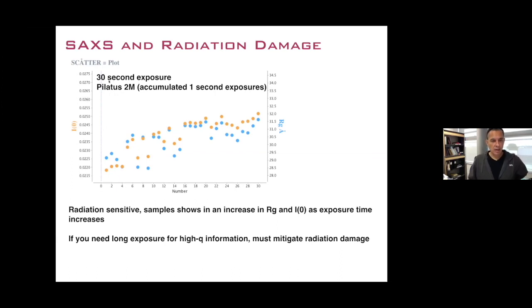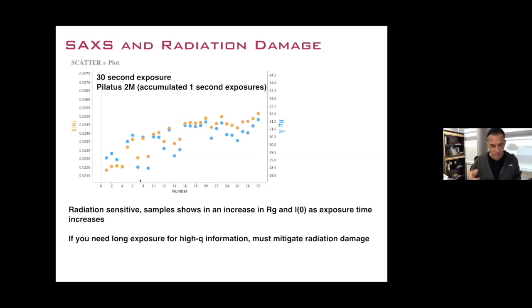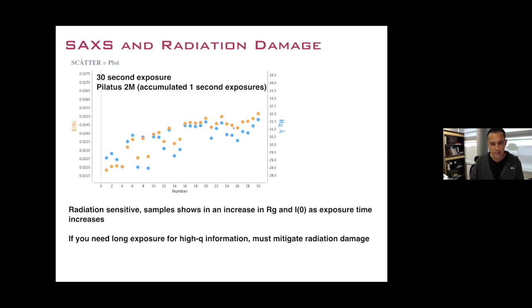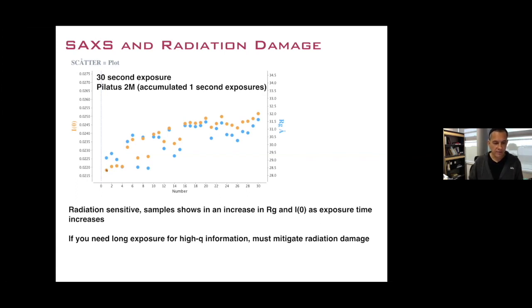The other thing that happens in SAXS is radiation damage. Here's a 30-second exposure — 30 frames at one second each. You can see that as we go to 30 seconds, the radius of gyration and I(0) are increasing, informing us that we have radiation damage. If you're going to merge this data you would likely only use the first 2 to 4 frames and discard the rest.